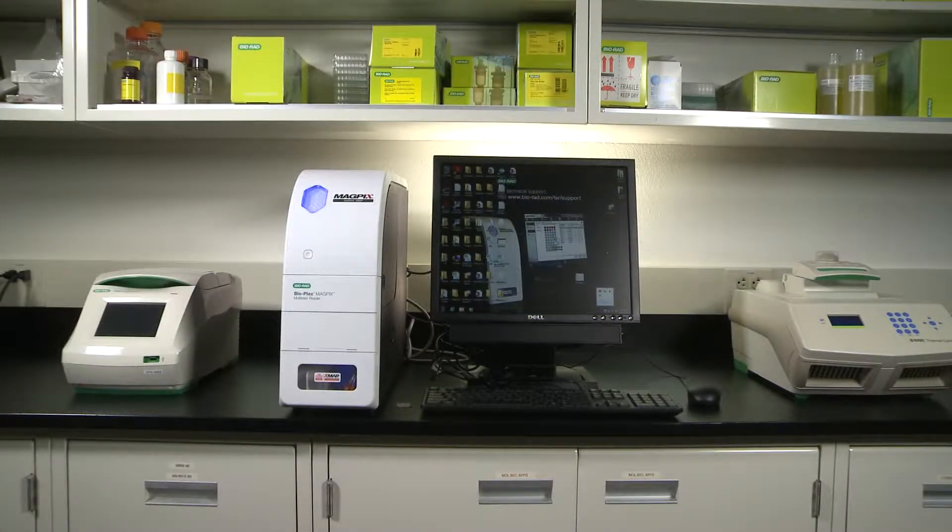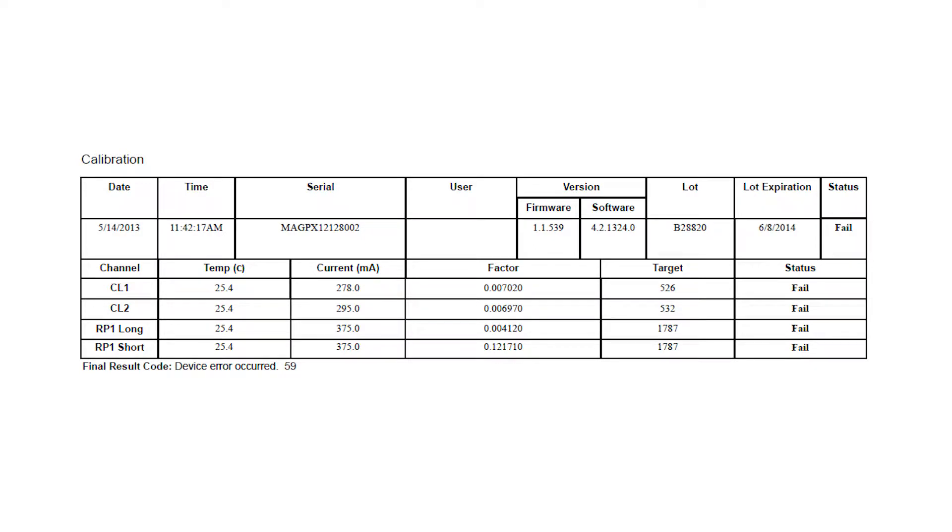There are situations in which the BioPlex MAGPIX instrument will fail calibration or verification due to a contaminated internal chamber. This will require an extended cleaning of the MAGPIX. This video will demonstrate how to perform an extended cleaning. This cleaning might be needed when the MAGPIX fails calibration with an error 59.